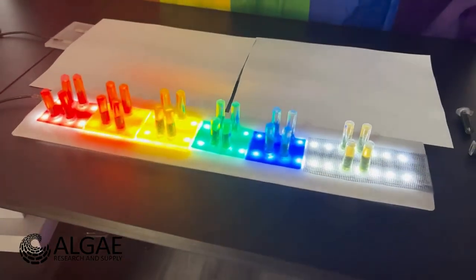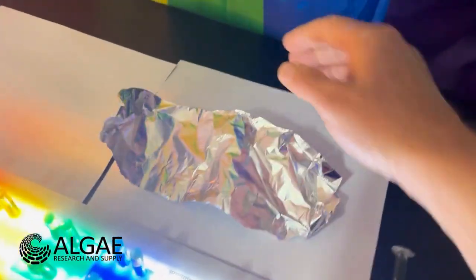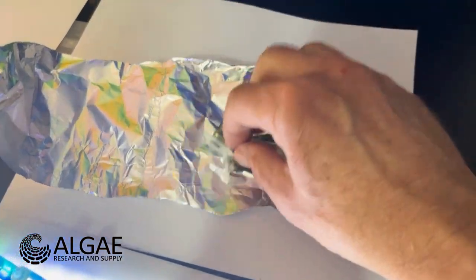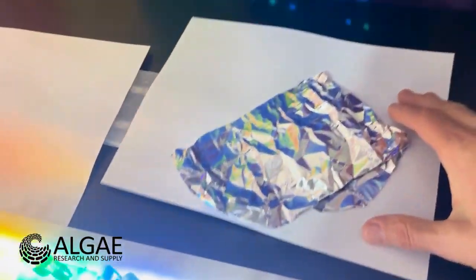Let's see what happens. Oh, and just to make it all fair, I have this imported from Europe. This is aluminum foil. You can get this here in the States as aluminum foil, but it's lower quality if you buy aluminum. It's better to get the European version of the aluminum. It holds out the light, so it's a dark sample.